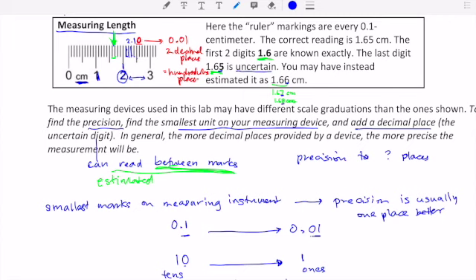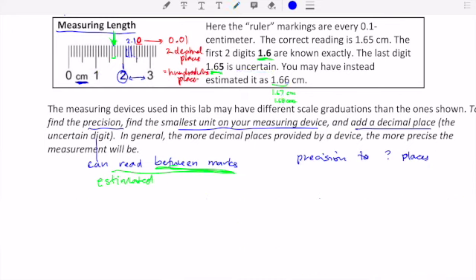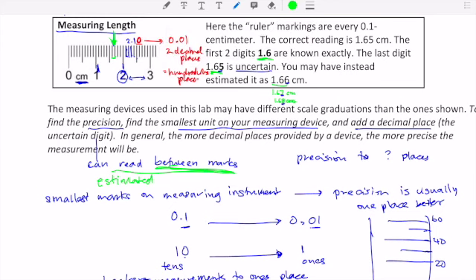And so I'll draw that real quick. Here's your beaker. And you can see this would be 10, 20, 40, 60, and those are the tens place. It's what are the markings on the beaker. And you can read in between the marks. If I draw what the liquid line would be here, this would be in between 20 and 30, this would be something like 25 milliliters. So that 5, underlined in purple, is the ones place, and that's the precision needs to be represented there.